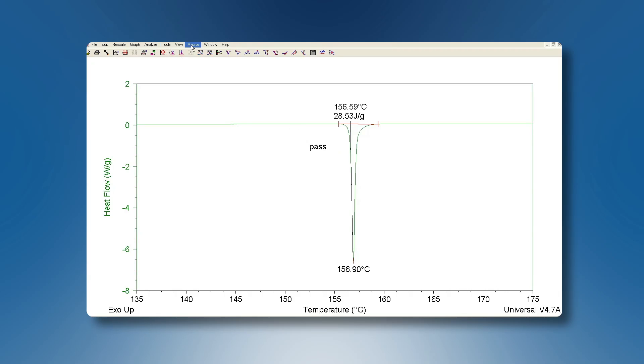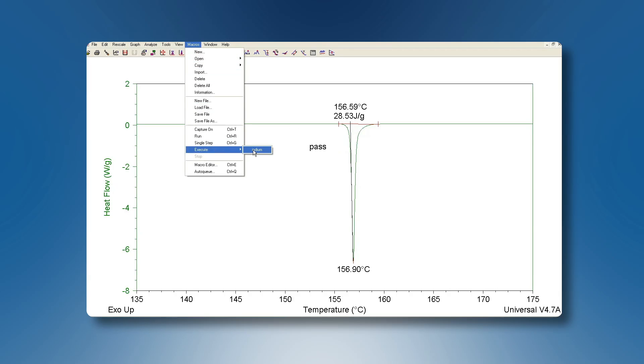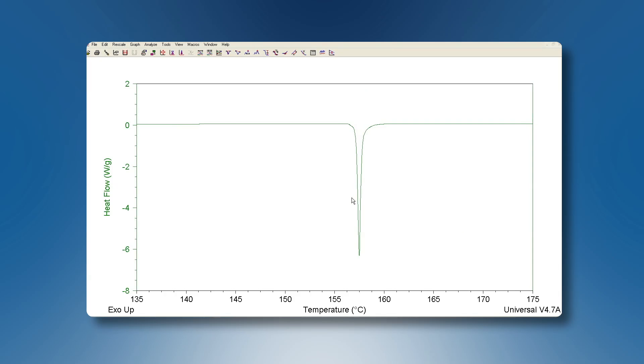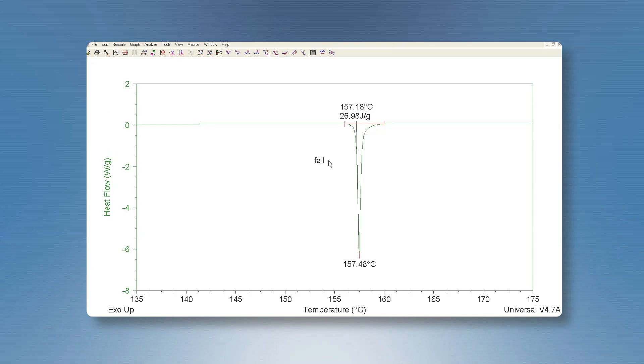Now we will try a second indium sample. For this indium sample the enthalpy is not within the specifications so we get a fail message displayed.